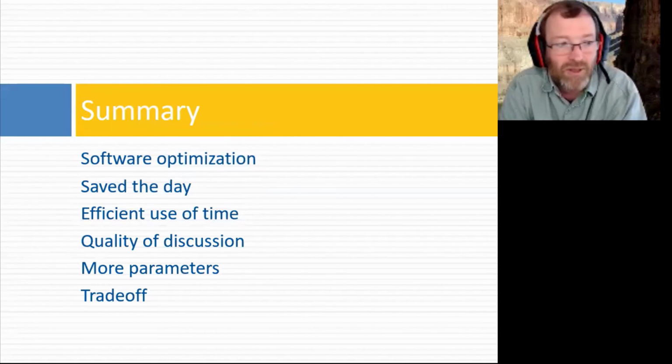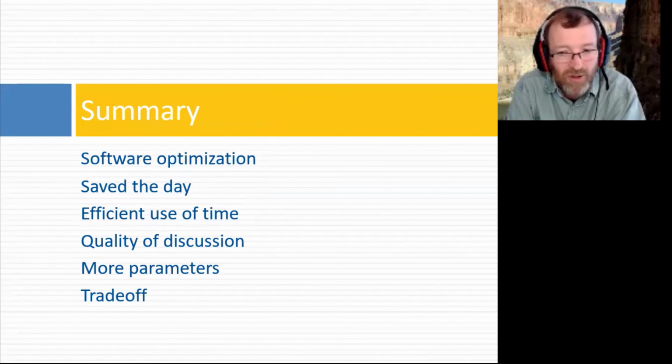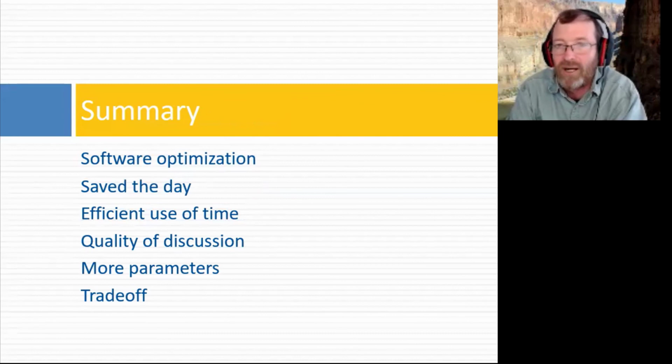So in summary, sort of the ACD software, it saved the day. It was a really efficient use of time. I was able to have really high quality discussions with my students. There were more parameters that we were able to adjust in the software than we would normally be able to do in real life. The trade-off is they didn't have the hands-on experience with the instrumentation, and they did miss that, and they acknowledge that.